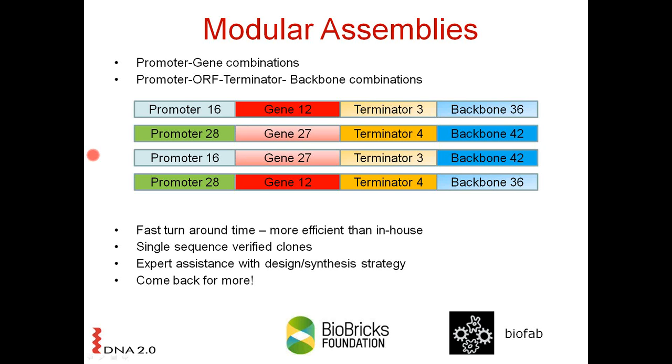The goal of this library is to assemble a bunch of individual elements that may include, in this case, promoters, open reading frame genes that encode proteins, individual terminators, and then different vector backbones, and then assemble those in specified formats. To make these actual individual brick elements, so for example, the individual promoters, the individual genes, those are essentially set up just as a standard gene synthesis.